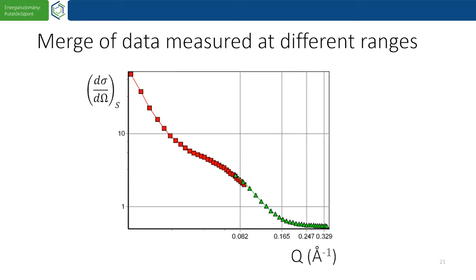The scattering intensity from a sample is a Fourier transform of the real space geometry of the sample. So if we make this Fourier transformation, we go from real space, from centimeters, to inverse centimeters or inverse angstroms. Okay, in inverse space. Thank you. So it's just easier to handle. It can actually be given in angles, like they used to do in X-ray diffraction.